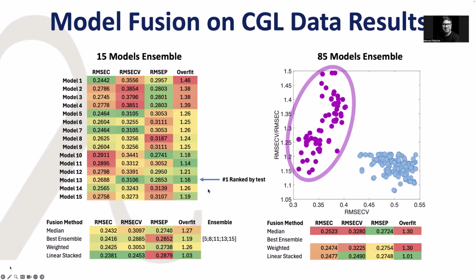And you can see that when we compare to, for example, the best ranked by, it's a little off there because the best rank is actually 1.14. But in any case, for the linear stack models, this is the overfit. So this one is still lower. I don't know what I was selecting by, but I do have to fix that. But we can see here that our best grand model is about 2741. The error we have here with the median is 2740.